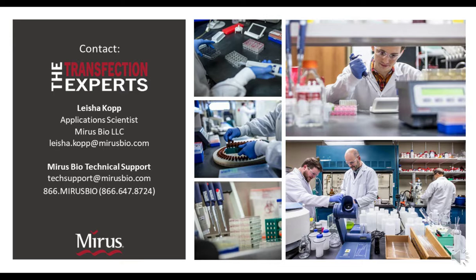Okay, so Leisha, the very first question is, you showed a complex formation time course out to 60 minutes. Have you tested longer complex incubation times? That's a great question. So thank you for asking. We have done minimal testing beyond these 60-minute time points. And so I don't want to draw any strong conclusions on whether or not that is going to be fine.